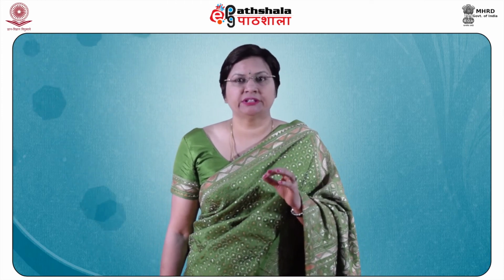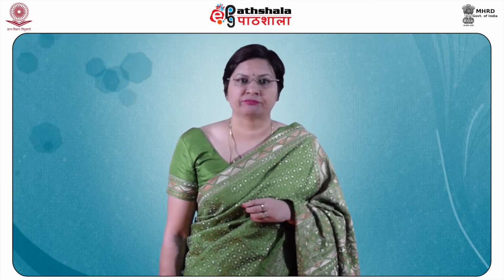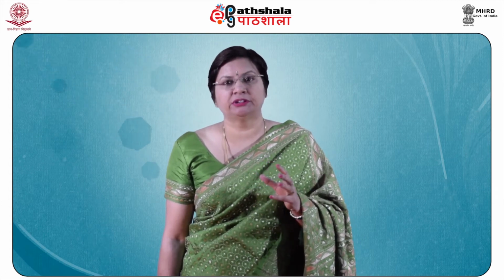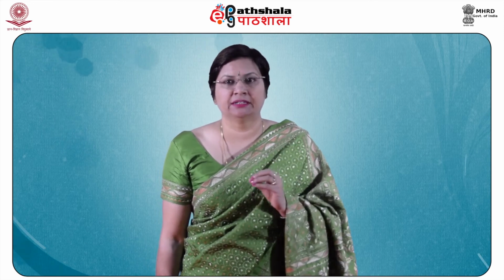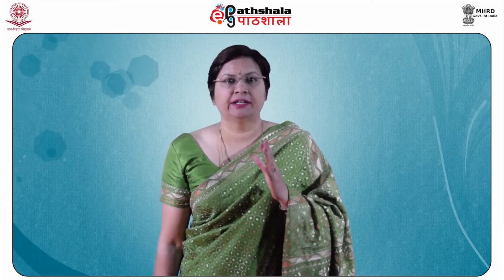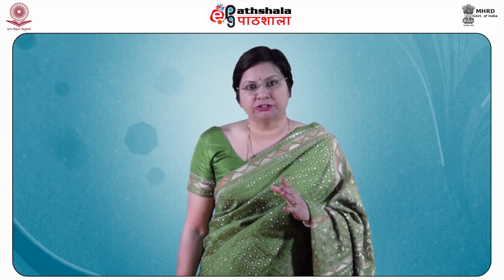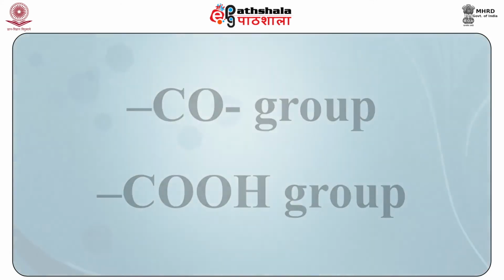The OH stretching appears as a result of strong hydrogen bonding, as you are aware. The presence of an acid group, that is COOH, is also shown by the NMR values, which give a singlet at the negative tau value. Thus, the compound under investigation contains the carbonyl group as well as a COOH group.